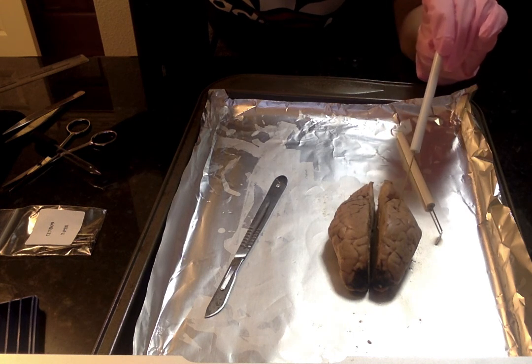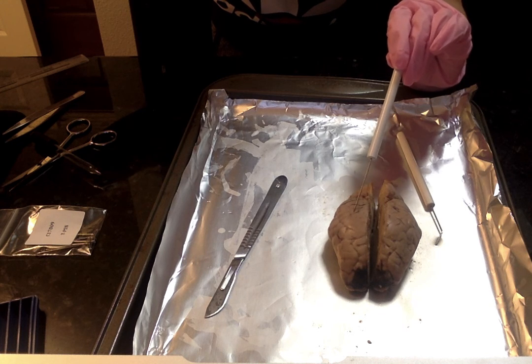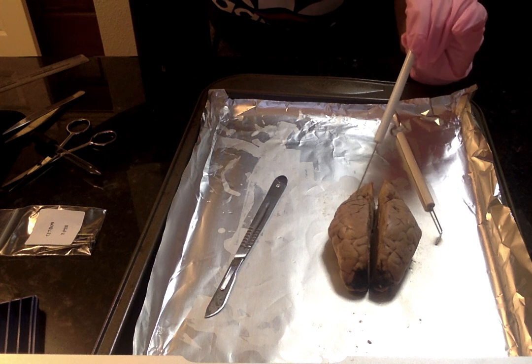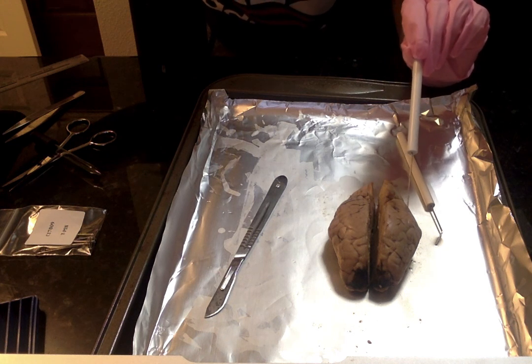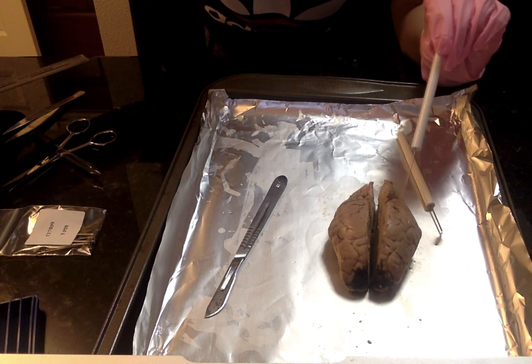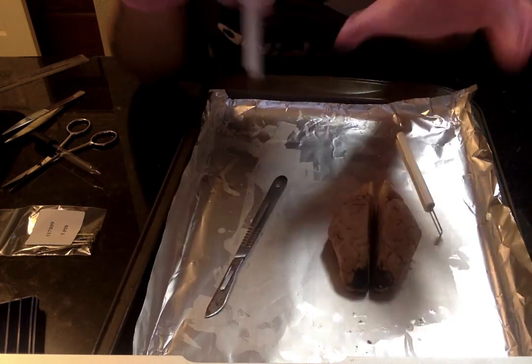And then the folding of the cerebral cortex right here, the folds, and the spaces in between the folds, that's basically the gyri and the sulci, and that separates brain regions and increases the brain surface area and the cognitive ability. The gyri and the sulci form boundaries within and between the lobes of the brain and divide it into two hemispheres.